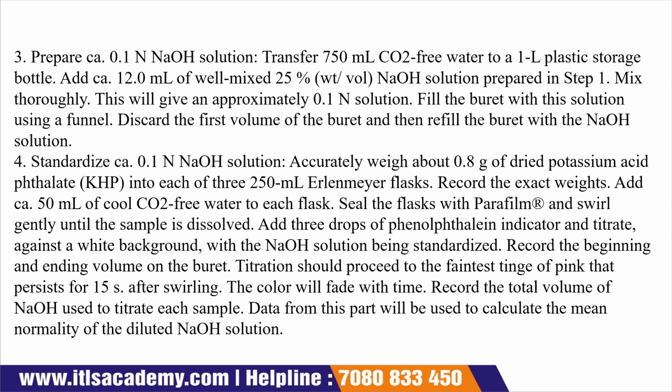Now the next one is to prepare 0.1 normal NaOH. For this, we transfer 750 ml of CO2 free water into a 1 liter plastic storage bottle. After that, we add 12 ml of well mixed 25% NaOH solution, which was prepared in the first step. See, what should we do? Transfer 750 ml of CO2 free water into a 1 liter plastic bottle.